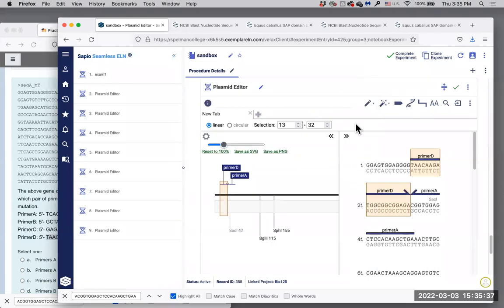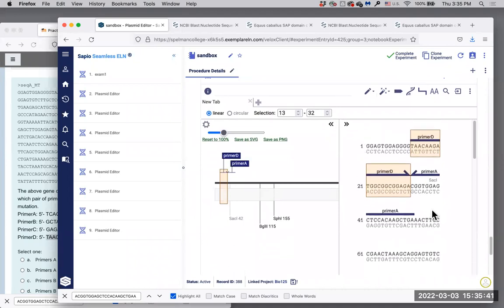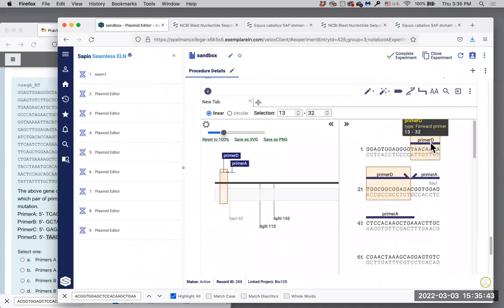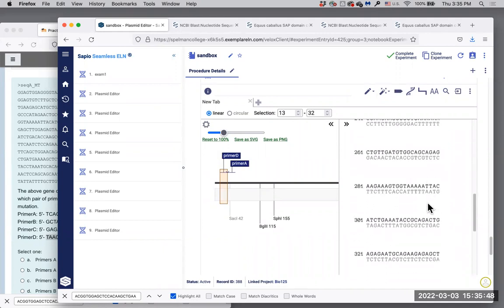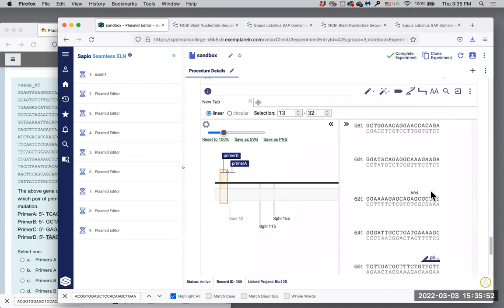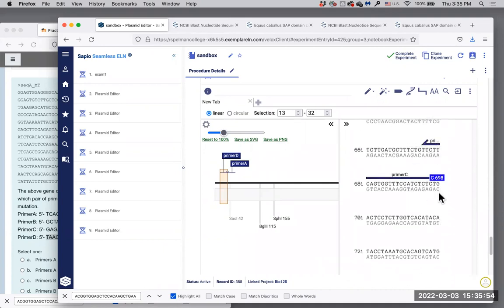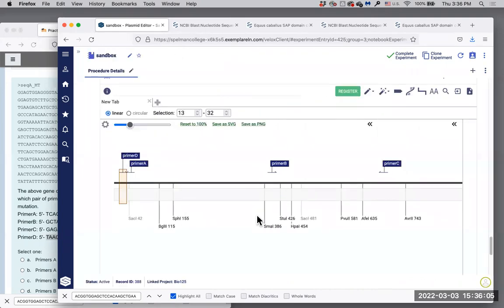So over here, all the primers were discovered on the sequence. I'm actually going to scroll through them to make sure that they look okay, right? Primer D, primer A, yeah, looks okay. And then primer B, yeah, looks normal. And then primer C is right here. Looks normal as well. So which pair is going to work in PCR? I'm going to actually look at the graphic version of this. So this is the entire linear sequence, right?